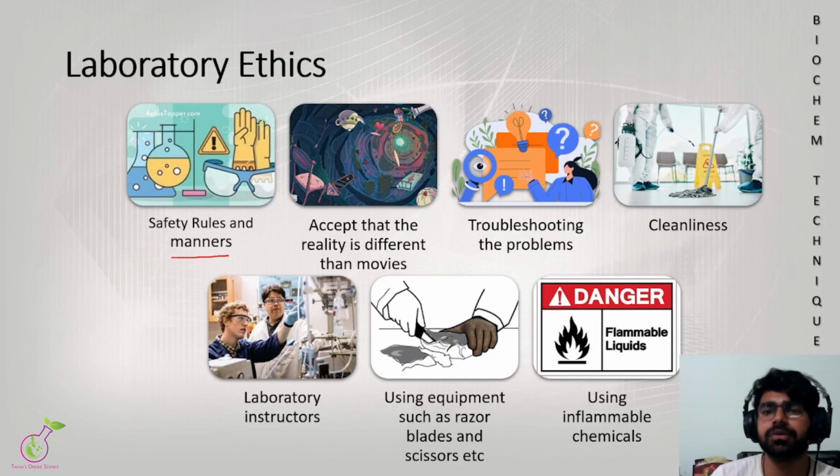Now why did I say when required? Because sometimes the gloves are not necessary. For example, if you are working with flame, gloves are sometimes very dangerous. This happened with us when we were in our MPhil: one of my fellows was working with flame while wearing gloves. These are plastic, silicone-type gloves. What happened was the glove caught fire and the glove stuck to his hand. It was very horrible to see that. So use gloves only when required.